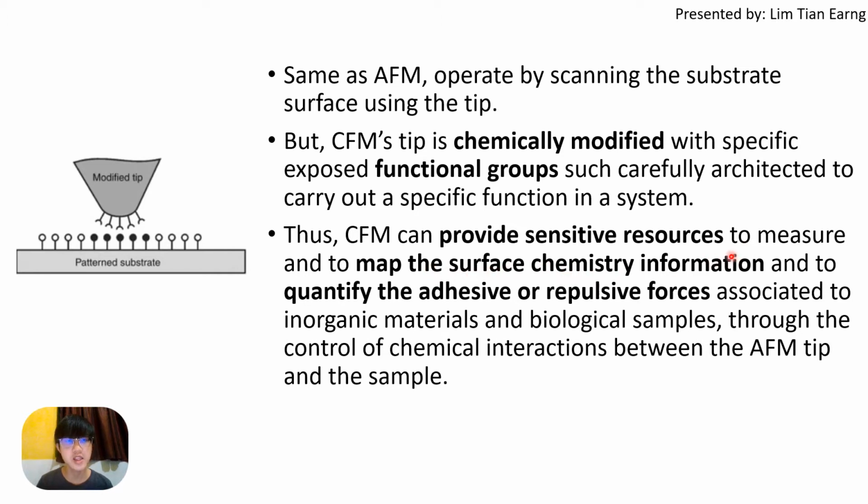From that information, you can quantify the adhesive or repulsive force associated with inorganic materials and biological samples, through the control of chemical interaction between the AFM tip and the sample.